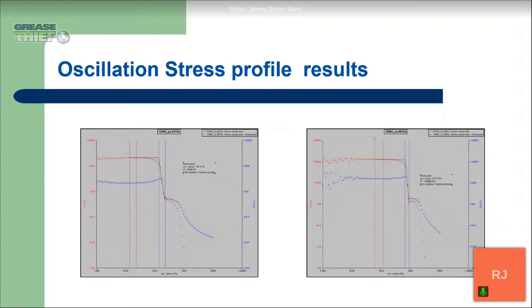So that would be important if these are comparing to the same baseline. One has changed drastically, or maybe they both have, and the baseline's in the middle. But I just wanted to point that out with the graphs, that even though they look the same or very similar, they have different responses as far as the G prime, or the thickness of that grease.